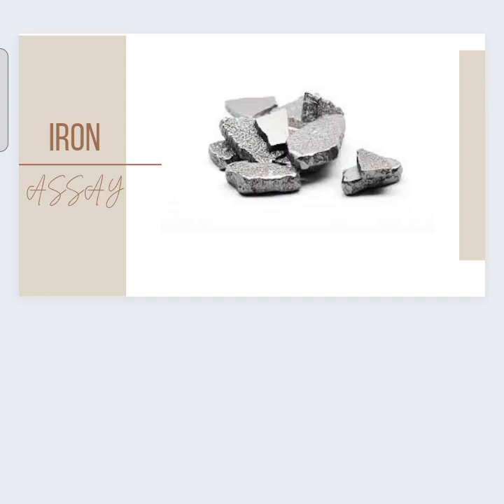Iron assay. Iron is released by the addition of an acidic buffer. Samples may be tested directly to measure Fe2+, or reduced to measure total iron, Fe2+ and Fe3+. Released iron is reacted with the chromogen, resulting in a colorimetric product at 593 nanometers proportional to the iron present.